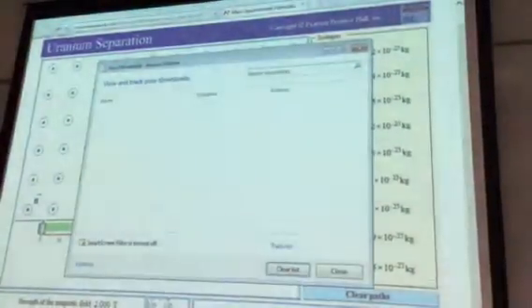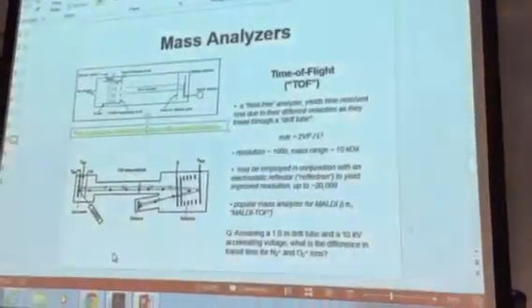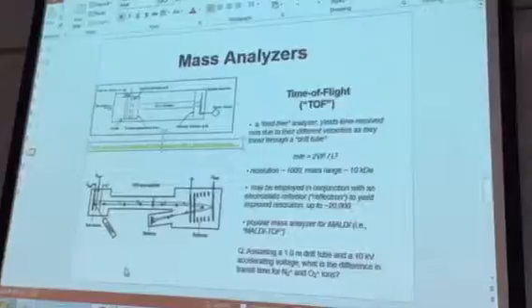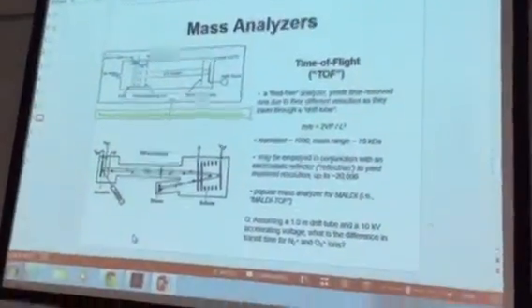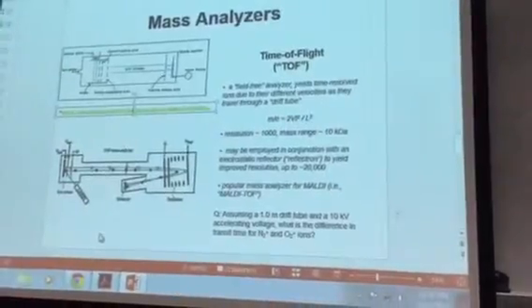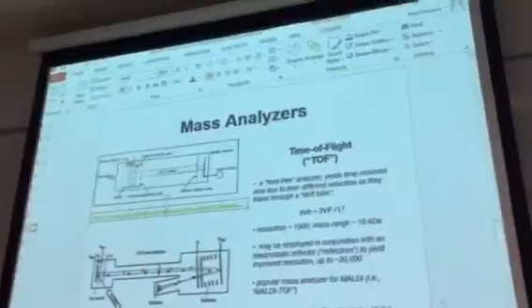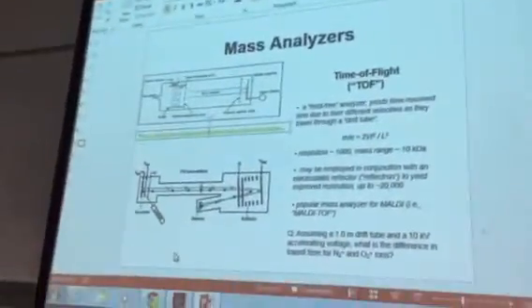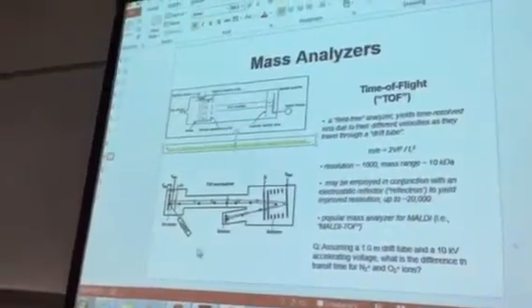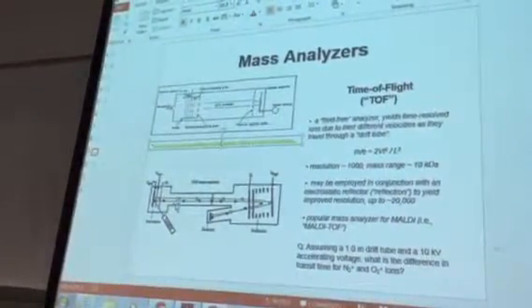Everybody good? Great. You can help yourself out a little bit. That's not a big deal if you have large differences in mass to charge ratio for the different components of your sample. But imagine that the masses for a couple of different ions are pretty closely spaced. They might be so closely spaced that the width of each individual peak causes overlap, interference, difficulty in resolving one of those two signals from the other. And so there are some approaches to get around that.